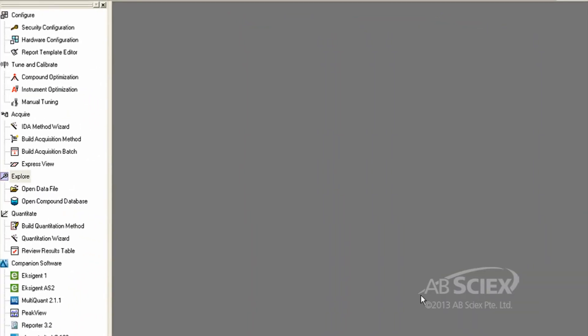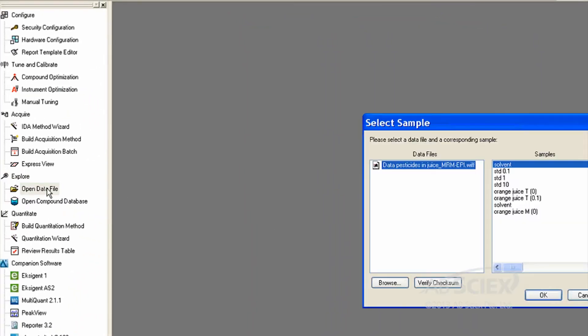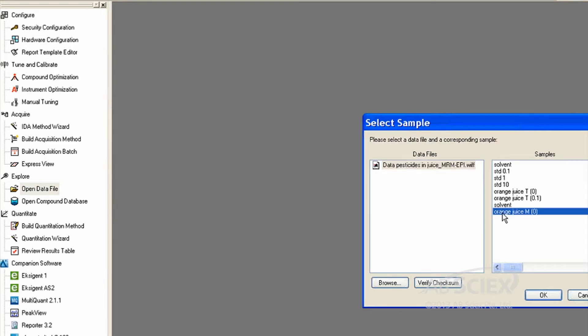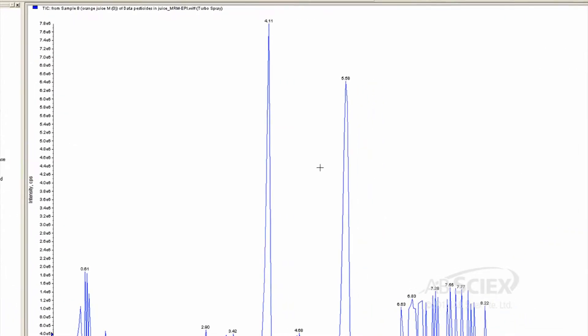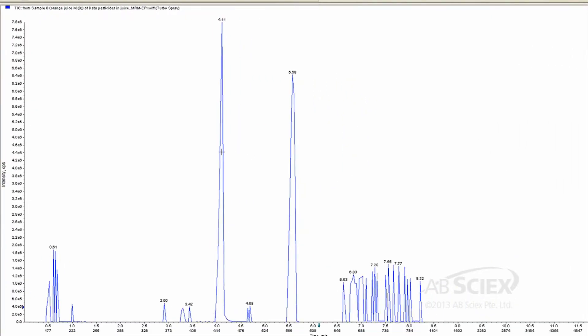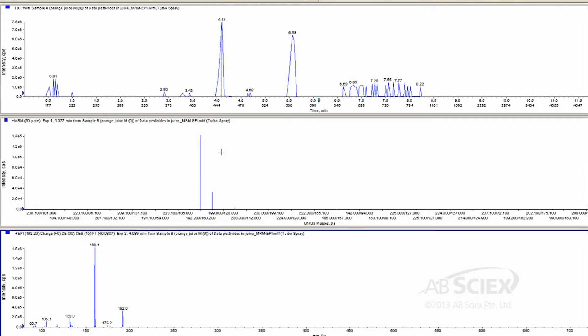Step 2: Open the chromatogram file for your sample of interest. Step 3: Double-click on the peak at the retention time of interest. In this case, it's at 4.1 minutes.